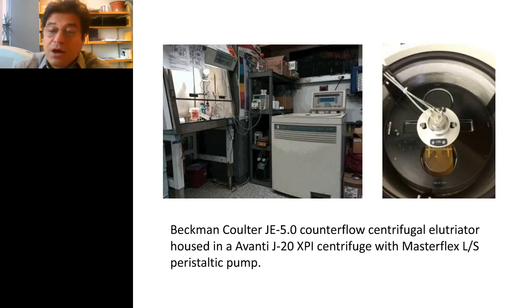In addition, by the way, this is the rotor inside the centrifuge, and this is really where all the action happens. You can see lines coming into it. That's where cells and elutriation fluid are being introduced, and then there's other lines where the cells are being removed selectively.